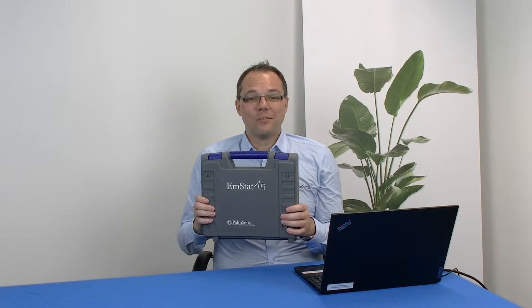Welcome to this PalmSense unboxing video. Today I would like to show you what you get when you order an Emstat 4R.